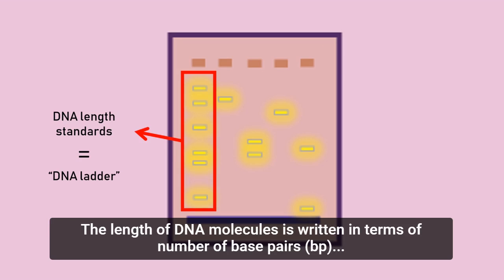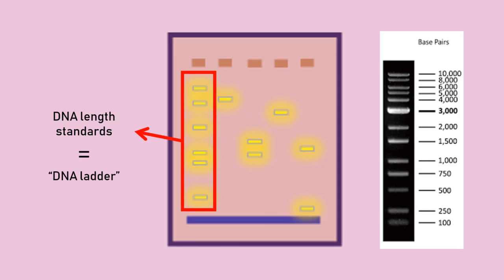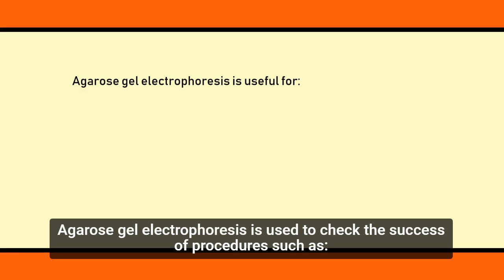The length of DNA molecules is written in terms of the number of base pairs, bp, or thousands of base pairs, kilobases, kb. By comparing the distance migrated by a DNA band in a sample to the distance migrated by the DNA bands in the DNA ladder, we can work out the approximate length of any DNA fragment.